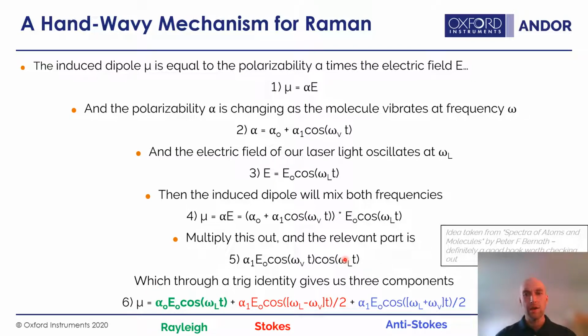If you imagine a visible light laser, that wavelength is very, very large compared to a molecule or a tiny little scatterer. So I imagine myself, I'm a molecule, I'm in the electric field of a laser that's being aimed at me. I don't see wiggles. I see this electric field around me going up and down with time, changing direction. So you experience kind of a bath of that. This molecule is in a time varying electric field. It doesn't necessarily know it's from a laser.